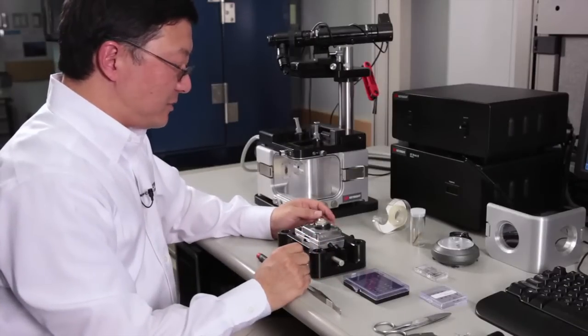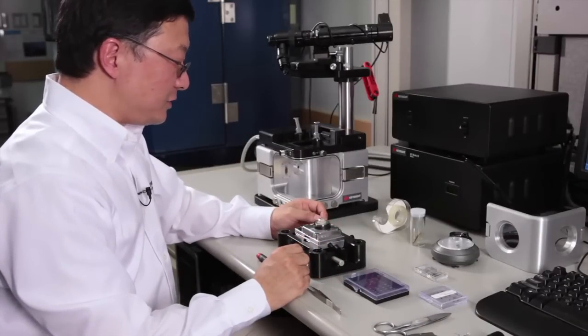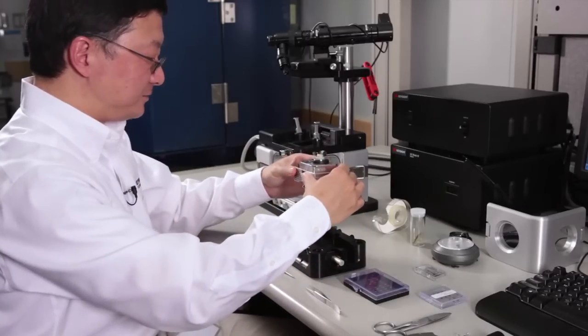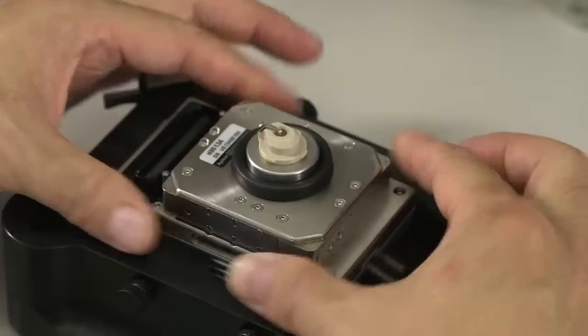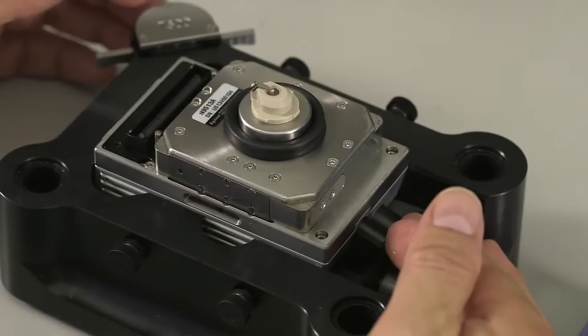Next is to mount the cantilever to your scanner. In order to do so, we need to have the AFM scanner mounted on the scanner station. If you are right-handed, you need to have the adjust knob towards the right-hand side.